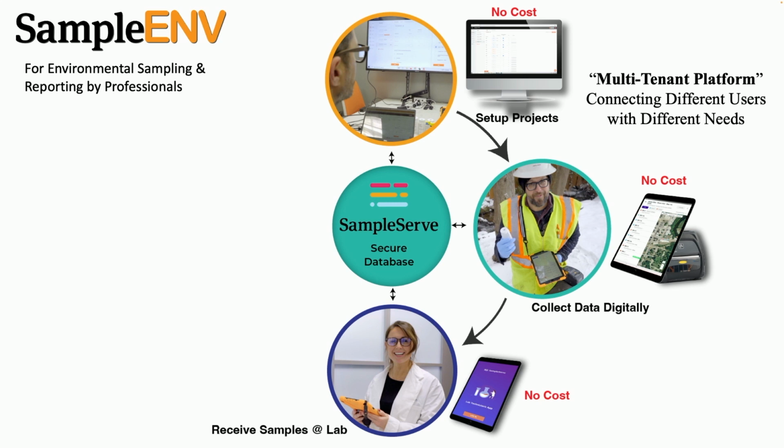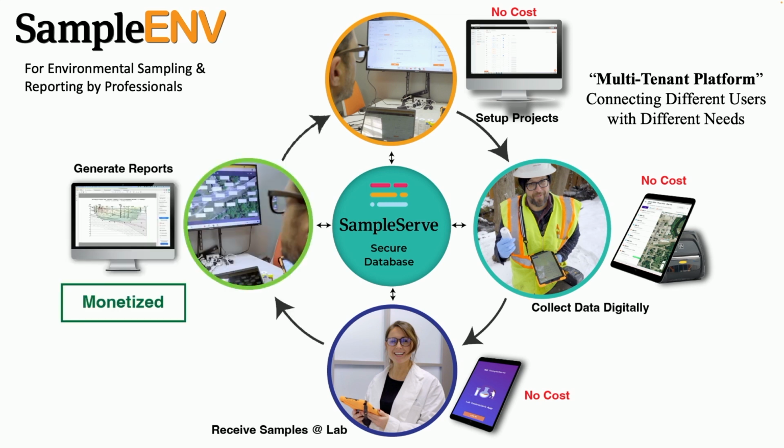Then, when they're done with the lab analysis, a week or so later, they're going to be able to upload the data back to the platform, and the project managers, the consulting engineering companies, are going to be able to generate all of the typical graphics and reports, showing where contamination is, where it isn't, what the concentrations are, and what direction it's heading.